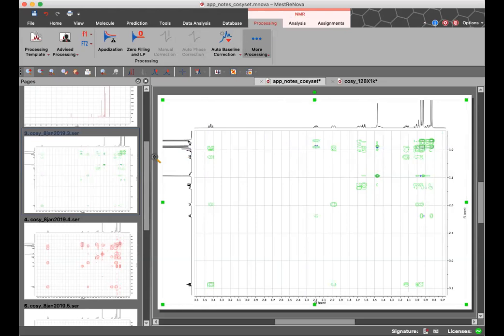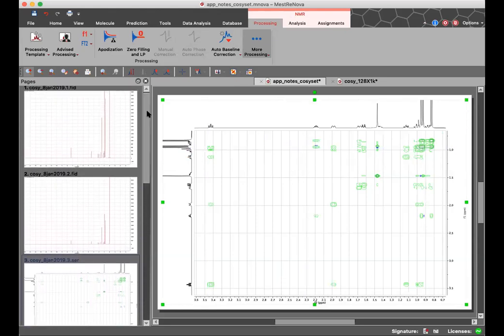And I think that's about it for COSYs. We'll move on now to HSQC.